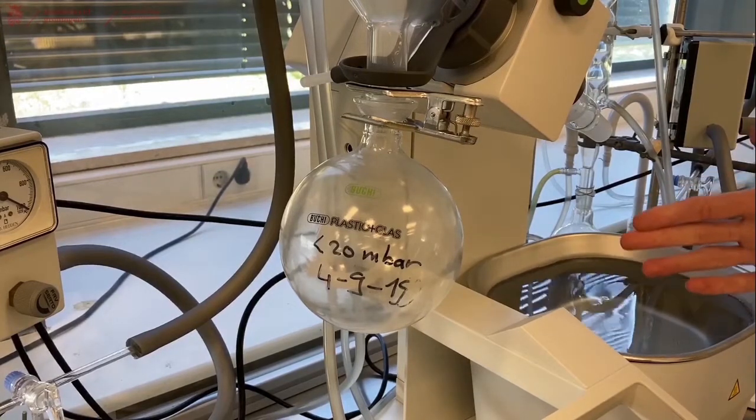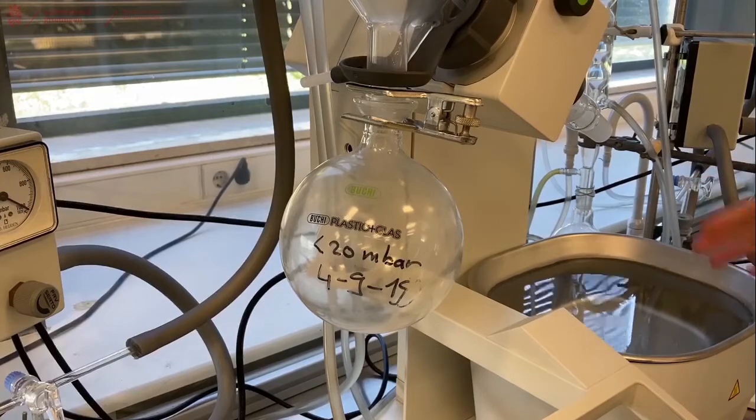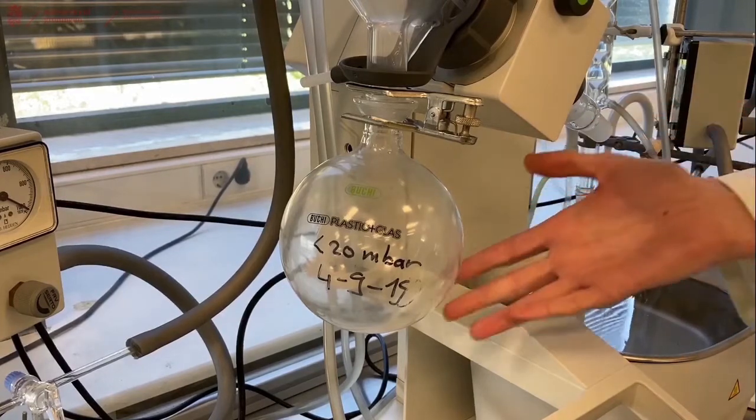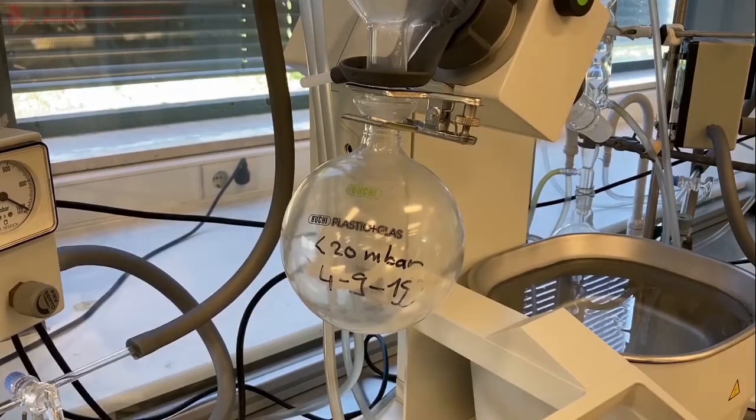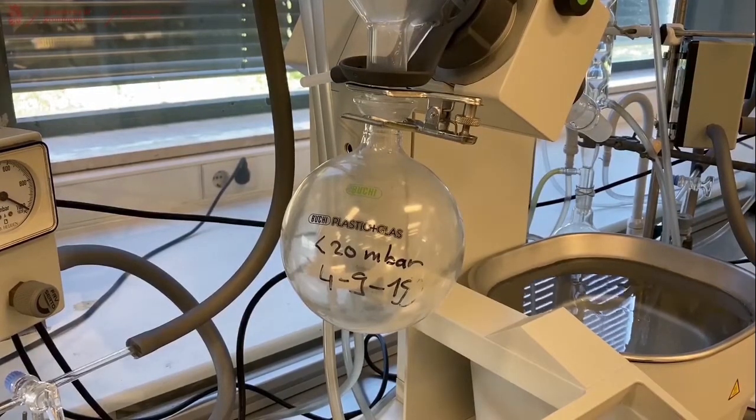Make sure that when you're done with the Rotary Evaporator, that everything is back to its original position. The flask is empty. Everything is dry. And that the next user can use it. This is how you operate a Rotary Evaporator.